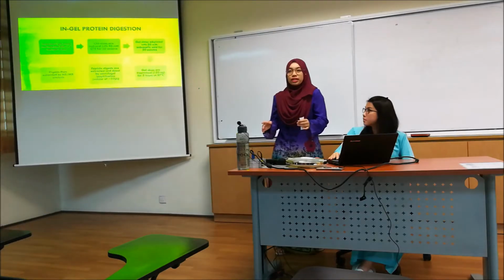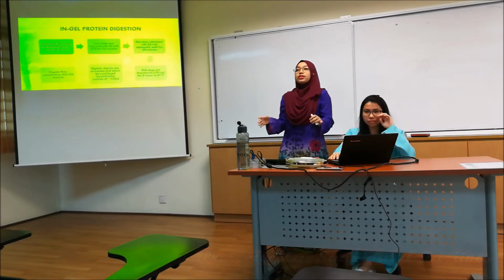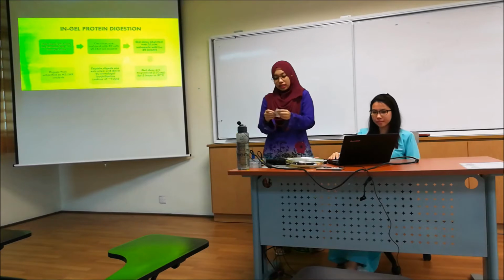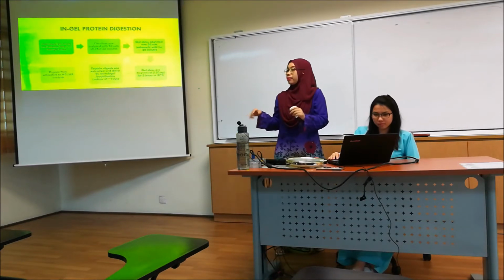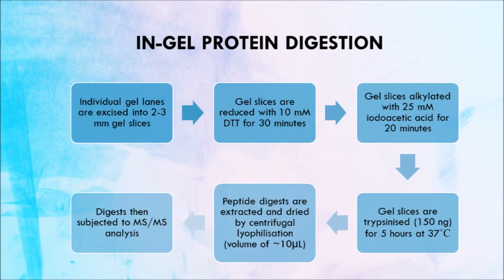What is in-gel protein digestion? This particular method is done in order to cleave the proteins present in the polyacrylamide matrix of the gel, after the SDS-PAGE stage.